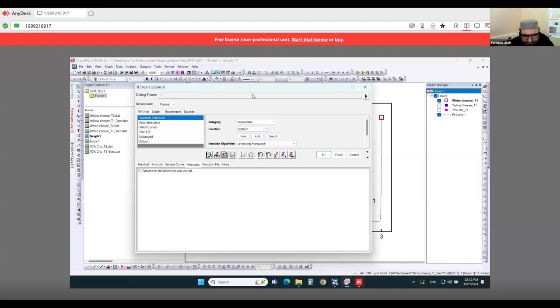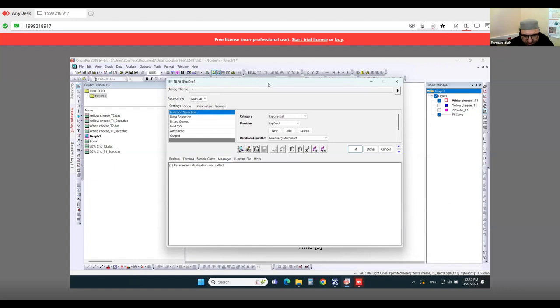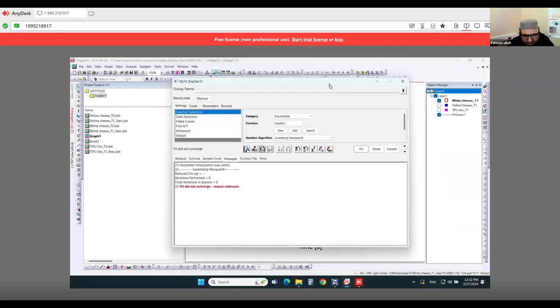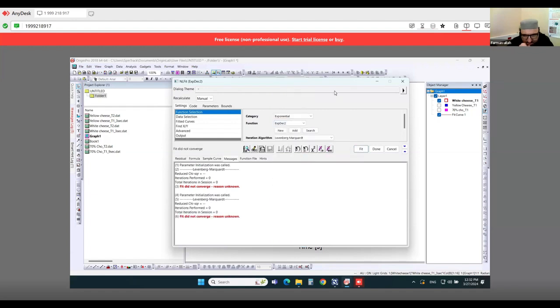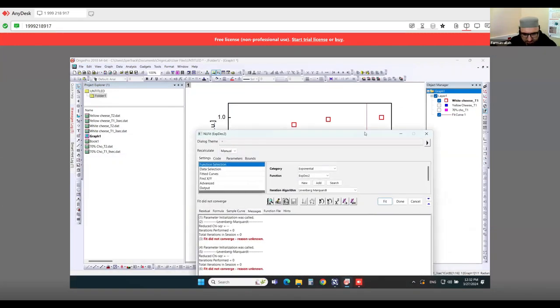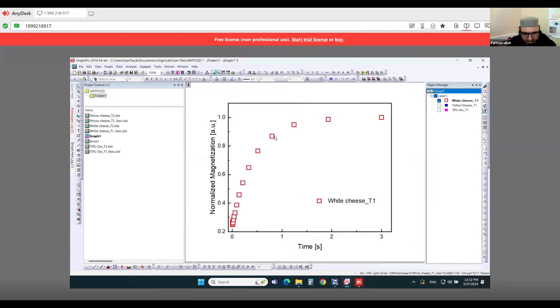Let's see what happened. It's totally diverged. So let's go to the second one. I think there is something. Let me set it again.